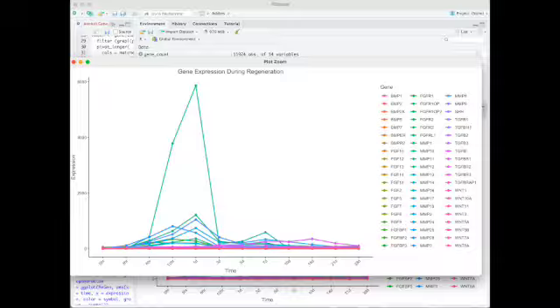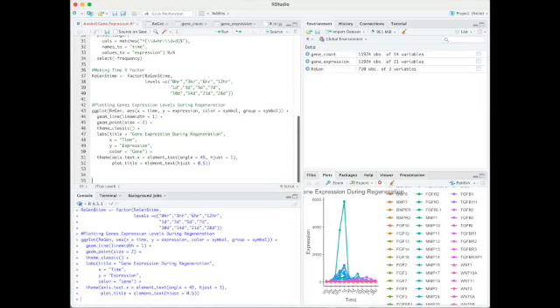This visualization shows us expression levels from all the genes within the family selected. The highest levels of expression are between 6 hours to 1 day, spiking around 12 hours, with an outlier from MMP12, showing maximal expression around 6,000 TPM. This increases the magnification of the rest of the genes, distorting our visual observation. To better observe the genes, we must remove MMP12.